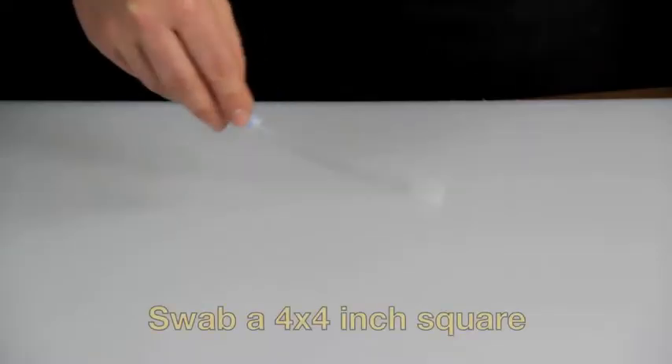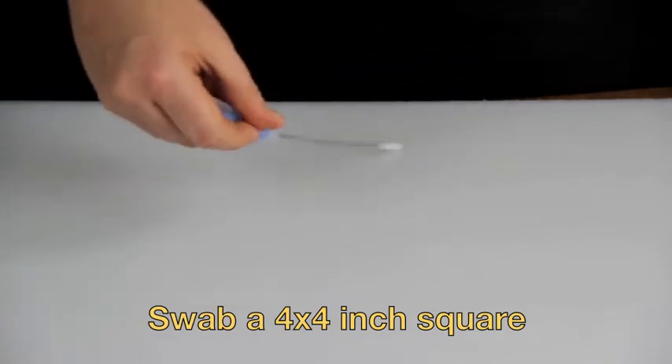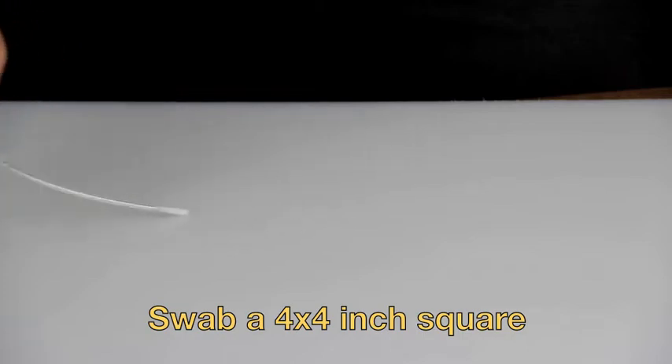Swab a 4x4 inch square area, making a criss-cross pattern, applying sufficient pressure to create flex in the wand, and rotating to collect sample on every side of the swab tip.